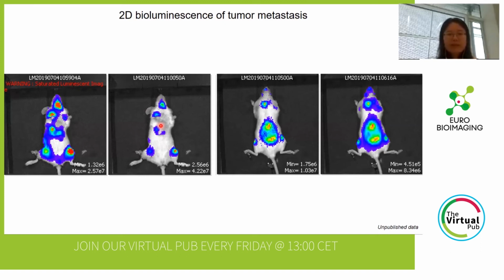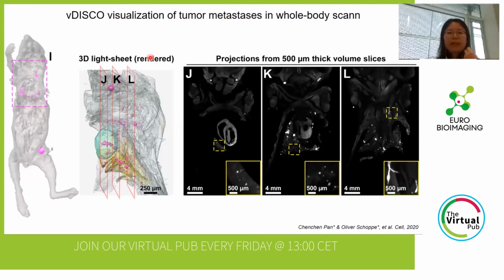So when we do the whole body clearing using vDISCO and the light sheet microscope, we can identify single metastases. Here also, these are the results for the same MDA-MB231 cancer cells, cancer metastasis mouse.